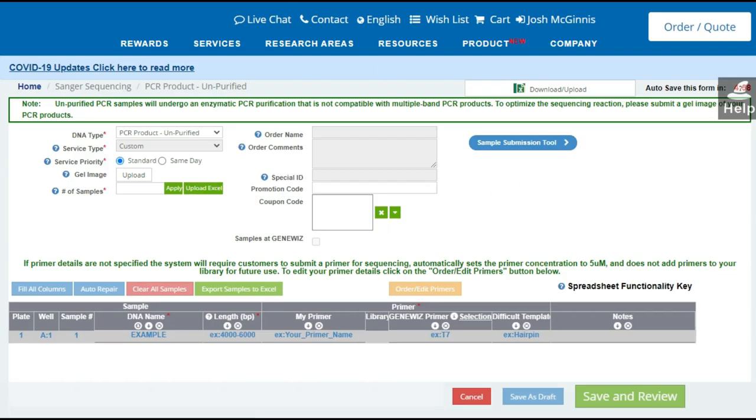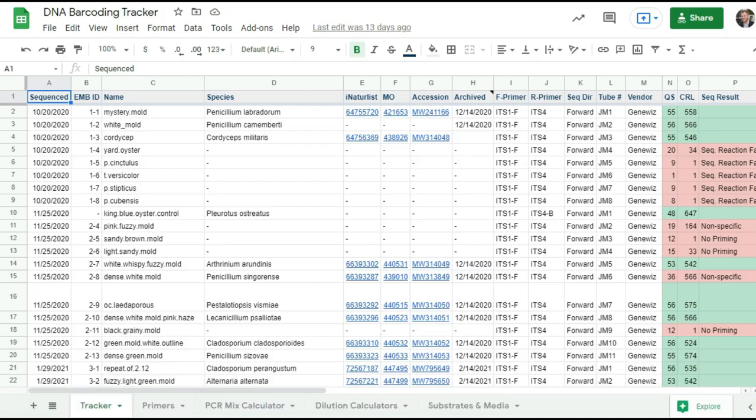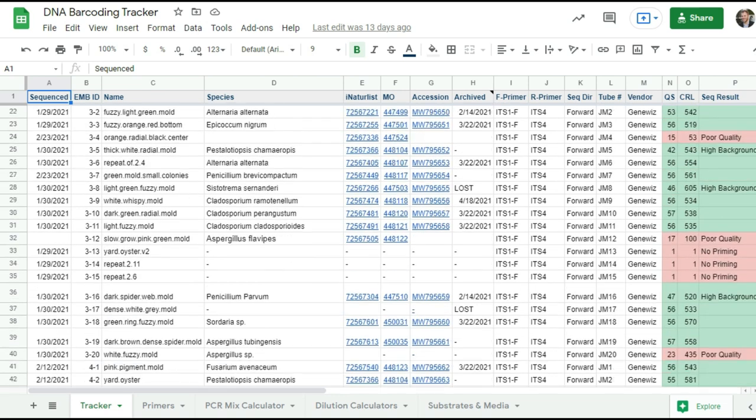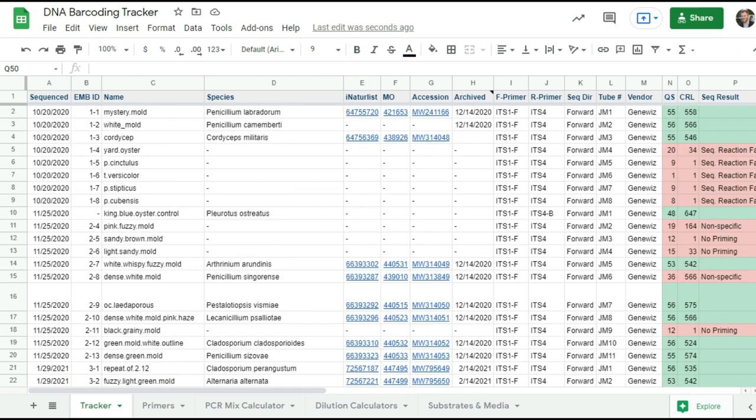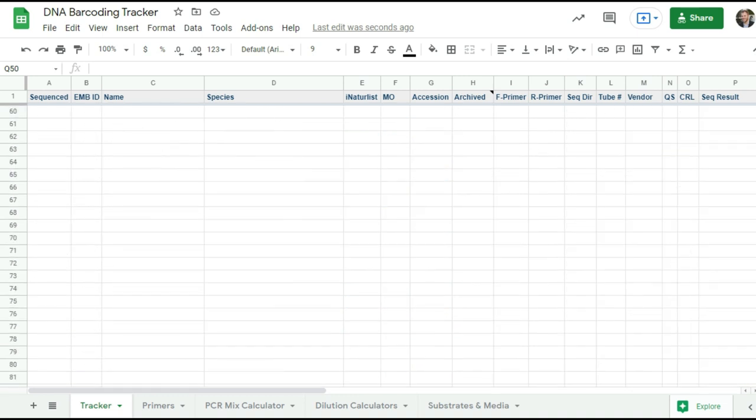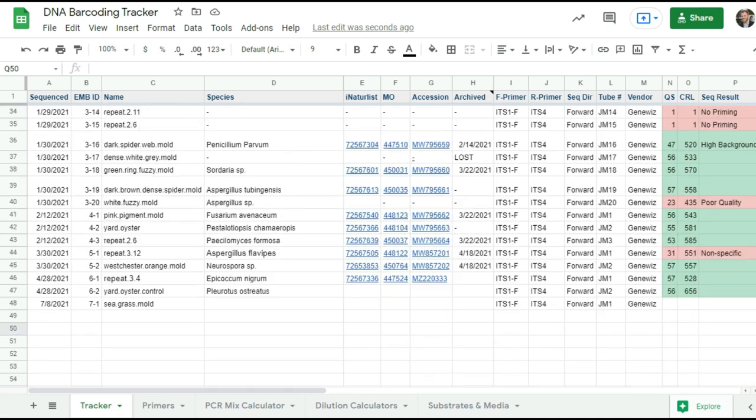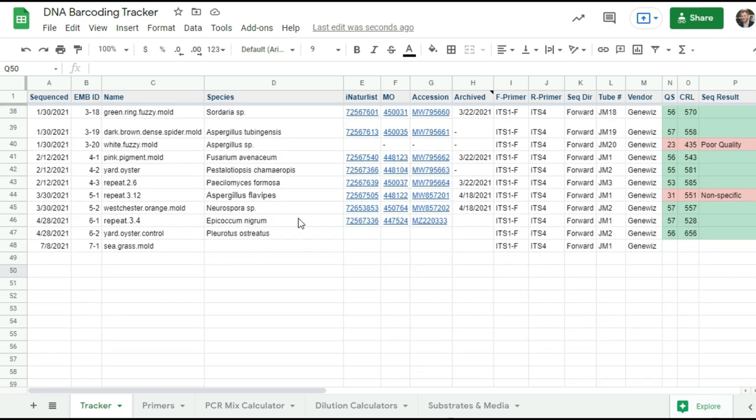Before we move on, I want to show you how I track my DNA barcoding samples. Because if you're doing a lot of them, and you're doing multiple orders, you will want to have some sort of centralized way of tracking them. So I've created this Google Sheet here. And whenever I have a culture, I will come in and put in a new entry into this spreadsheet. You can see that I have one already.